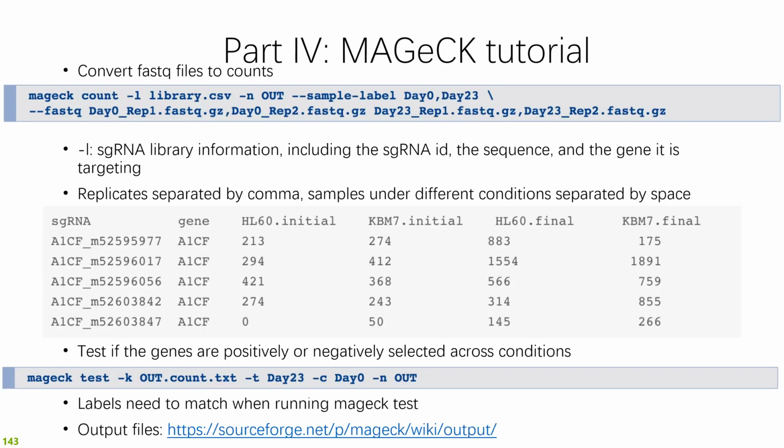For question 4, at the start of part 4, it will ask you to look at the QC metrics of MAGeCK, but really you need to first run MAGeCK and generate the files yourself. We provide you the CRISPR screen data at day 0 and day 23, and you need to first generate the count table for sgRNAs.